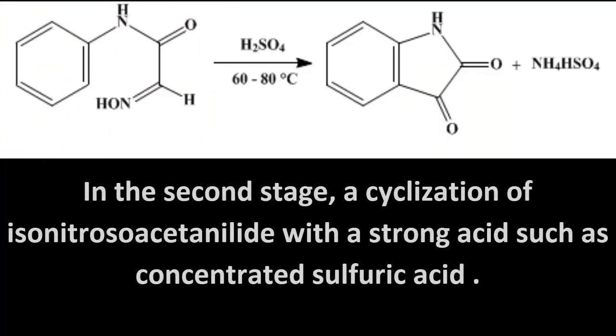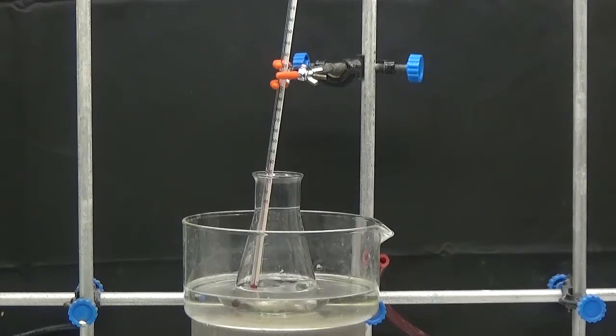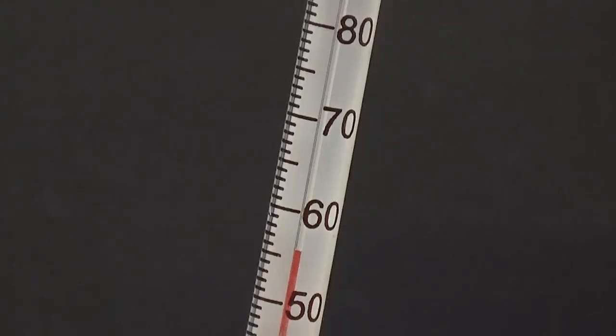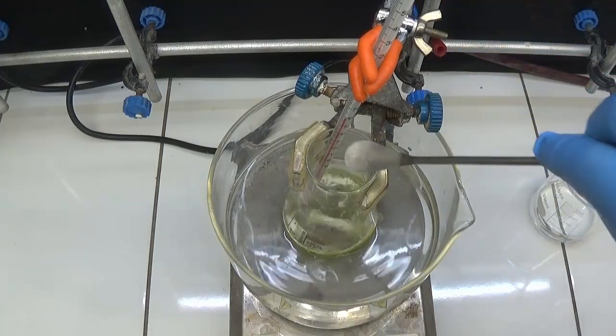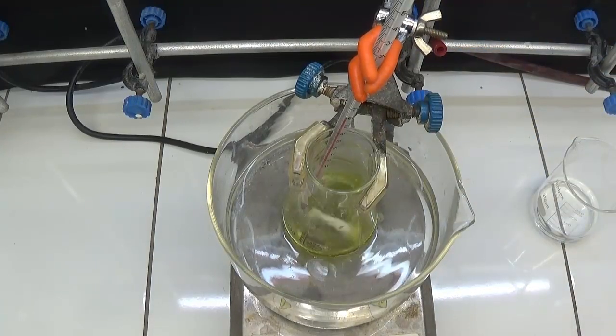In the second stage, a cyclization of isonitrosoacetanilide is performed with a strong acid such as concentrated sulfuric acid. The isonitrosoacetanilide is added to a 100 ml Erlenmeyer flask with 25 ml of concentrated sulfuric acid and a temperature monitoring thermometer. Add the isonitrosoacetanilide to the flask in small portions maintaining the temperature between 60 and 70 degrees Celsius.